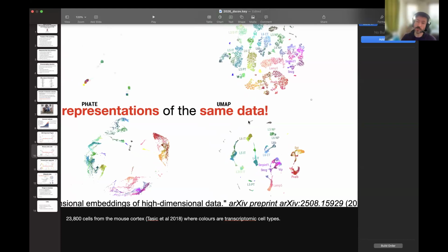Of course, the drawback is your data is very overly discretized. So if you don't want super tight clusters, maybe UMAP is not the right choice, but you can play around with the different parameters in there. And yeah, it has the same drawback as TSNE where the long distances are not interpretable at all. So like this cluster's distance to this cluster over here is not really relevant.